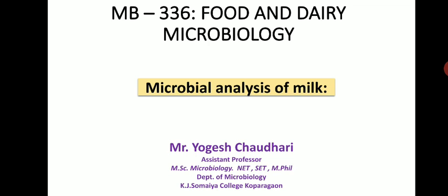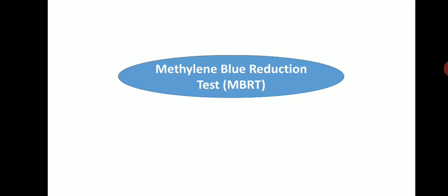So today we're going to start with a new topic, that is microbial analysis of milk. In this particular topic we're going to see different tests that are routinely used for analysis of raw as well as pasteurized milk and milk products. In that we're going to study the methylene blue reduction test.